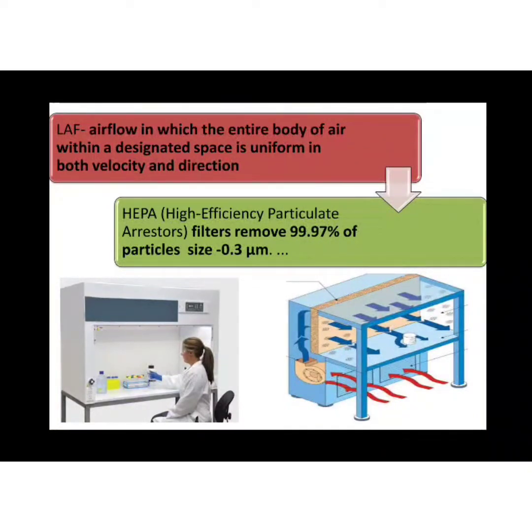Now when we talk about the filtration process, filter pads should be available. So what is the filter used here? It is called HEPA filters, HEPA, that is high efficiency particulate arresters or high efficiency particulate air filters.